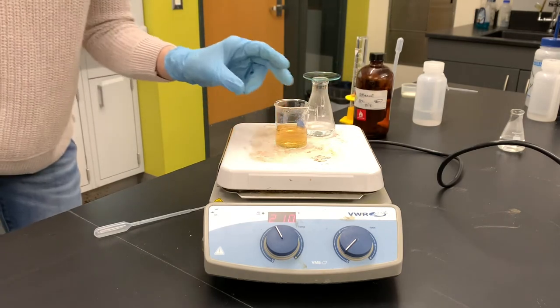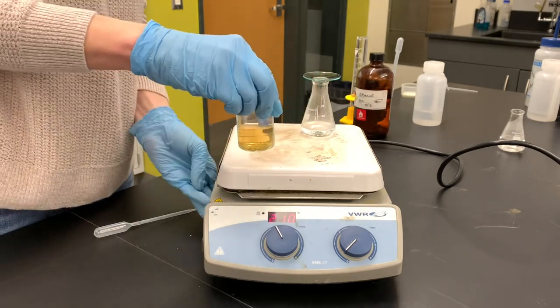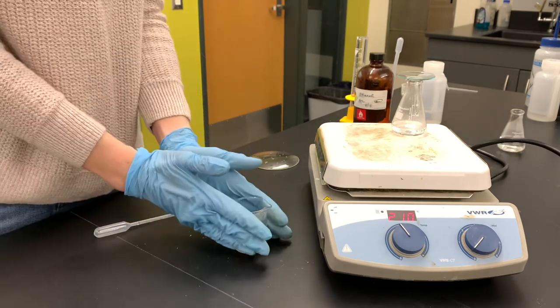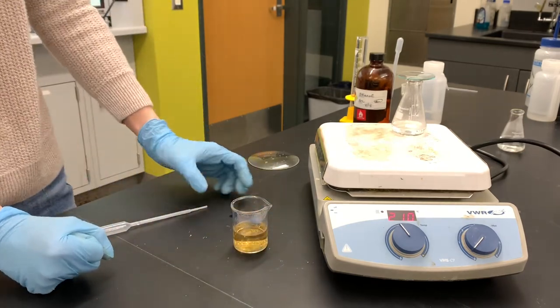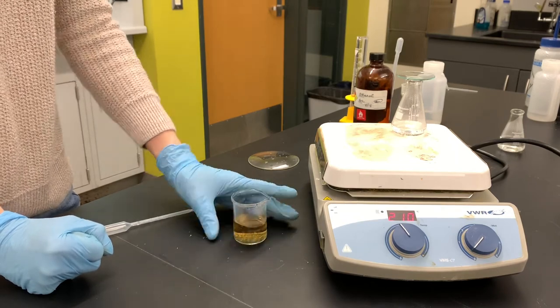This has been completely dissolved, and what I'm gonna do next is just let this cool down to pretty much room temperature, just sitting here like this. And then after it's been cooled down a bit, I'm gonna transfer it into ice and let it finish crystallizing, and then we will filter it one more time.